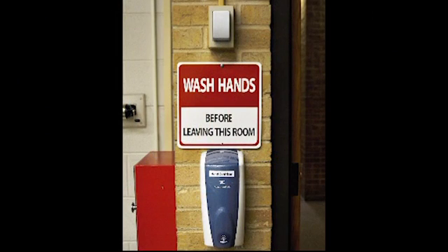One final reminder: before you leave the lab for any reason, always remember to wash your hands with the antimicrobial soap. Or if there is an immediate need to leave, use the antiseptic hand sanitizer, which is by the door exit. It is also recommended that you wash your hands again when returning to the lab. Remember to also leave your lab coat or other cover-up in the lab when leaving the lab.